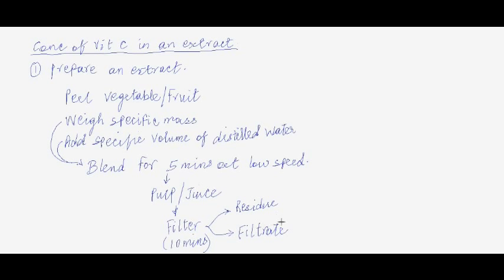And this filtrate contains the vitamin C, which we will be using for the rest of the experiment. So that's step one. The first step is how to prepare an extract.